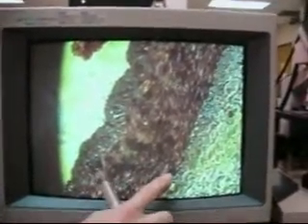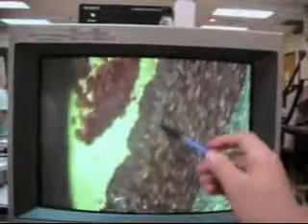All right, this is now, all of you get ready to say your prayers. So you can see this. You see this undulating little system here. I know it's hard, but it's there. That's as bright as I can get it. That is the internal elastic lamina. Where's the pointer? Okay. And there is an external elastic lamina. It's not as prominent here, but it's there. And you'll have to look at it on your own slide.